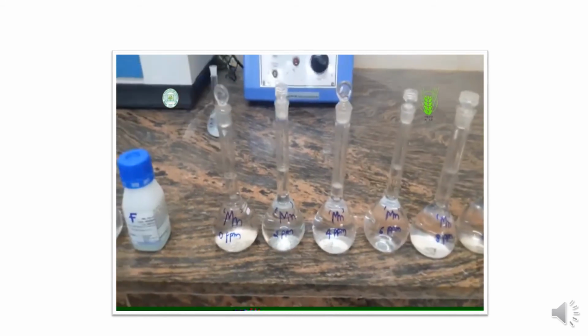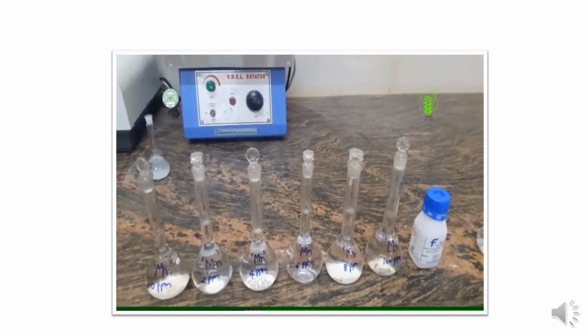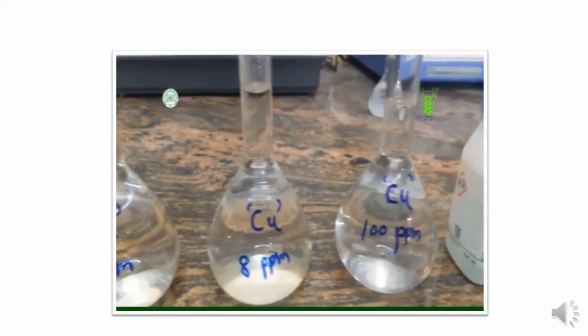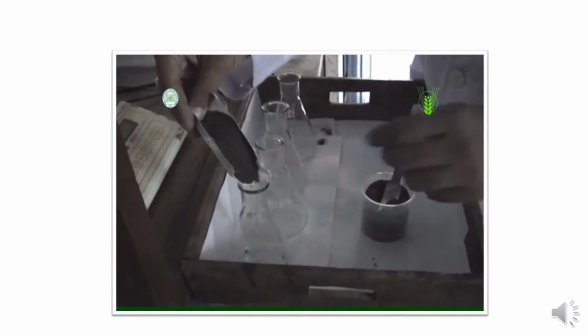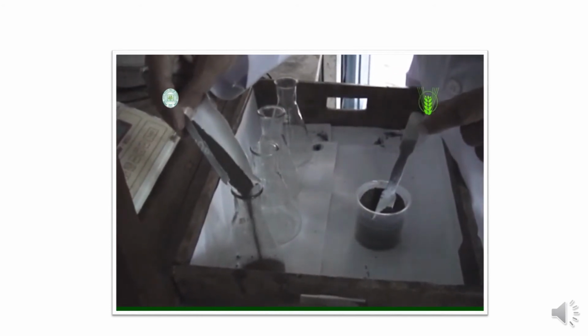Similarly, like zinc, we can prepare the iron solutions. A different series of standard solutions will be prepared, as already shown in this video. Similarly, the manganese standard solution will be prepared. And copper as well.